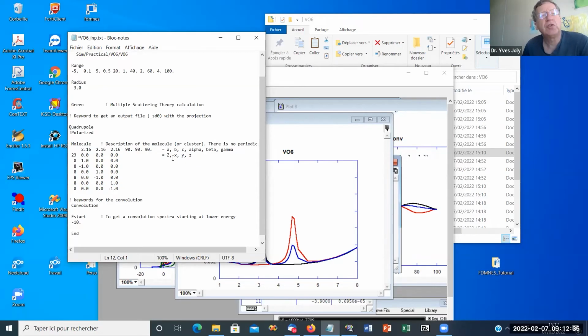To lose the center of symmetry, you could displace any of the atoms as you like, but I am going to move the central vanadium a bit. So it's not necessarily at the center, but it mustn't be too much, because you have to think that 0.15 here is multiplied by 2.16 angstrom. So it's already nearly 0.3 angstrom. So it's rather a lot. So it must remain reasonable.